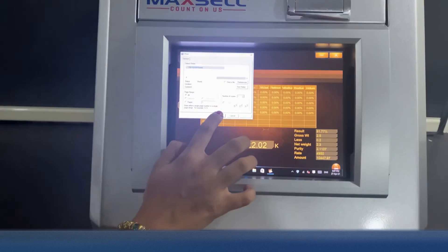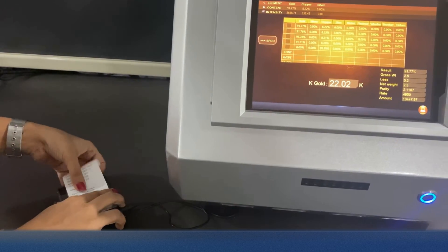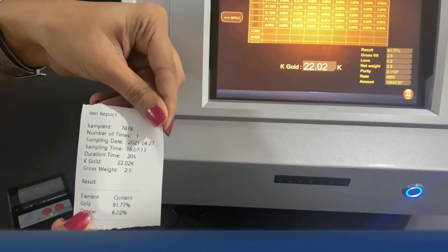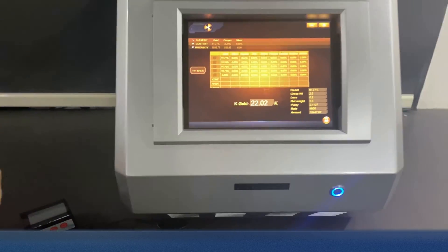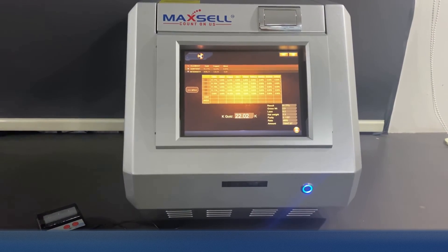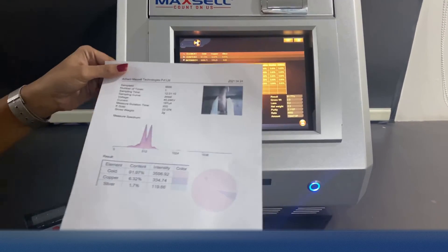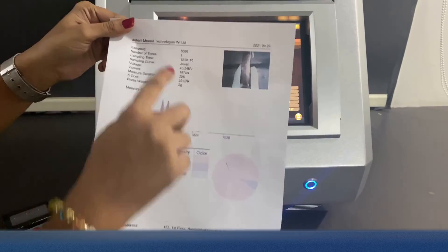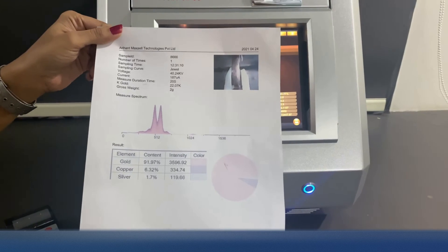Along with the net weight, you also get an estimated amount of the jewelry. If you need a printout of the details, you can get it with a click of a button through the POS printer. The Maxell gold testing machine is quite handy — if you need a printout in PDF format, that is also possible. You can get the company name, address, and many other details on the PDF and present it as a report.